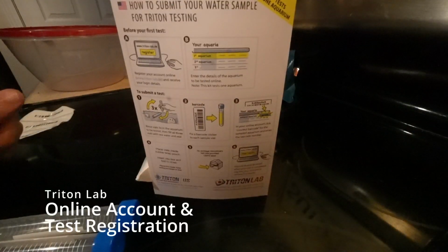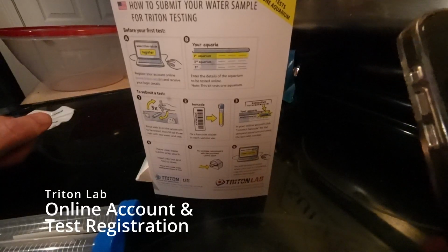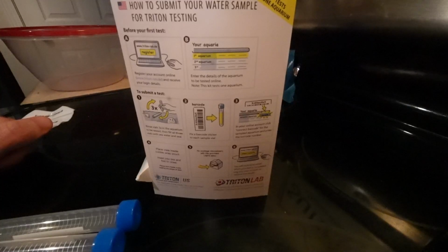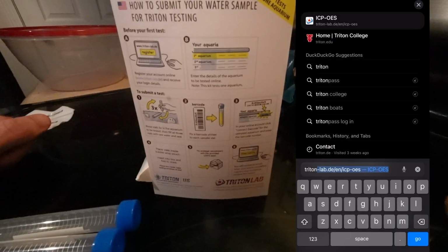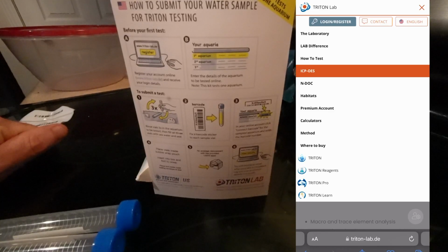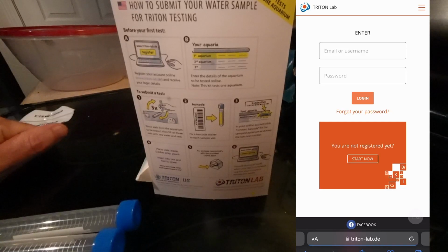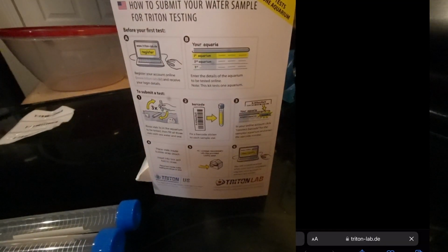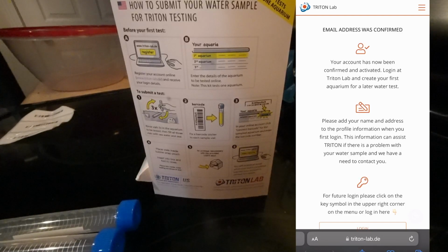All right, let's go ahead and begin setting up our online account and getting our tests registered. So per the instruction card, we need to go to triton-lab.de. All right, at the top, it says login or register. So I'm going to select that. I'm going to go ahead and create my account. Once your account is created, you will receive a confirmation email. So make sure you confirm your account.